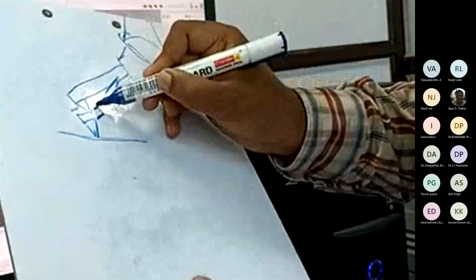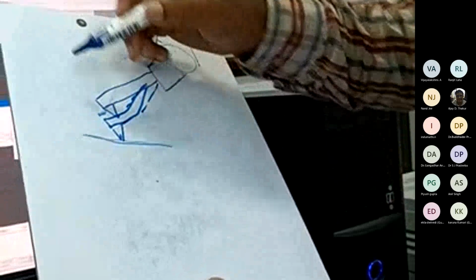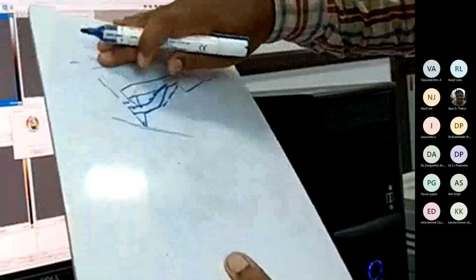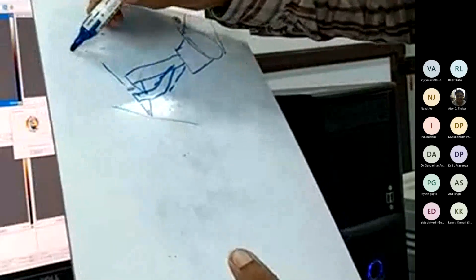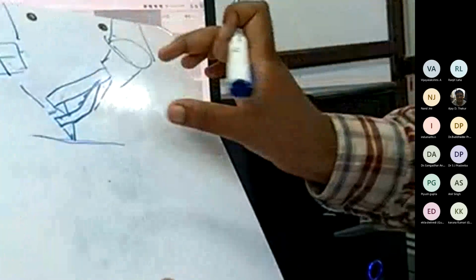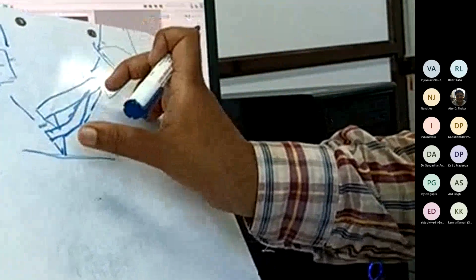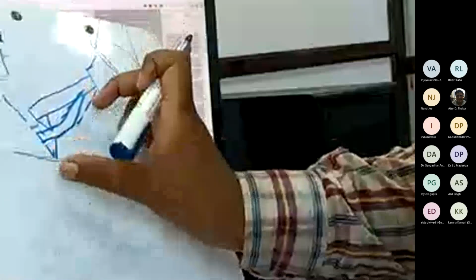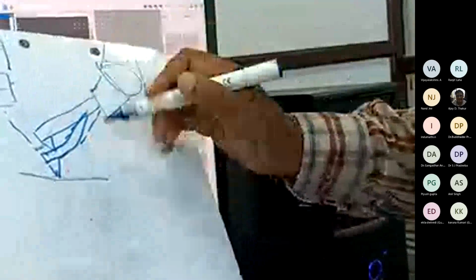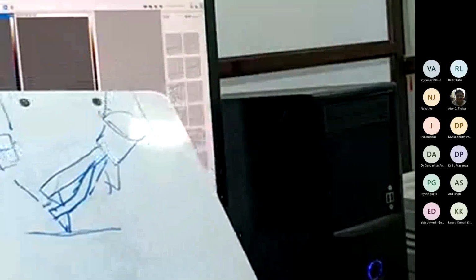That deflection is detected by the laser, sorry, photo detector, and on the basis of that, it stops there. Means the feedback circuit says to stop at that point. In this way, it does the auto approach. Okay.